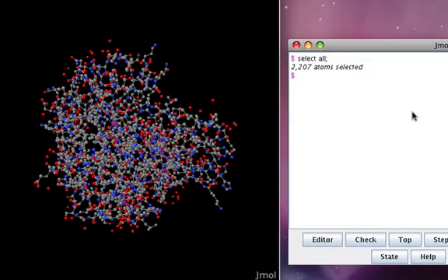With the selection phase complete, the next step is the makeover phase, and here's where you're actually going to influence the appearance of what's in the window. There are all kinds of commands to do this, but in our particular case, what we want to do is focus on the residues only in the active site. So let's take the entire structure, turn it into a simpler view, and then only show the ball and stick view for the residues in the active site.